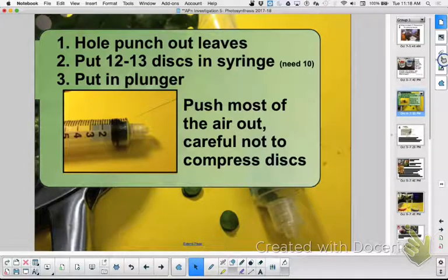Now besides water, water with CO2, water without CO2, what else needs to go into this beaker? Yeah, and you want to keep that number the same, and you don't want it bubbly soap, because that will cause a problem too. You just want to put your 1, 2, 3 drops in there. If you accidentally put 4, that's going to be fine. Just put how many in the other one? 4, right? Because you're going to keep it as a what? Constant. Perfect. Okay, now I would be mimicking this with the baking soda at the same time. Does that make sense?